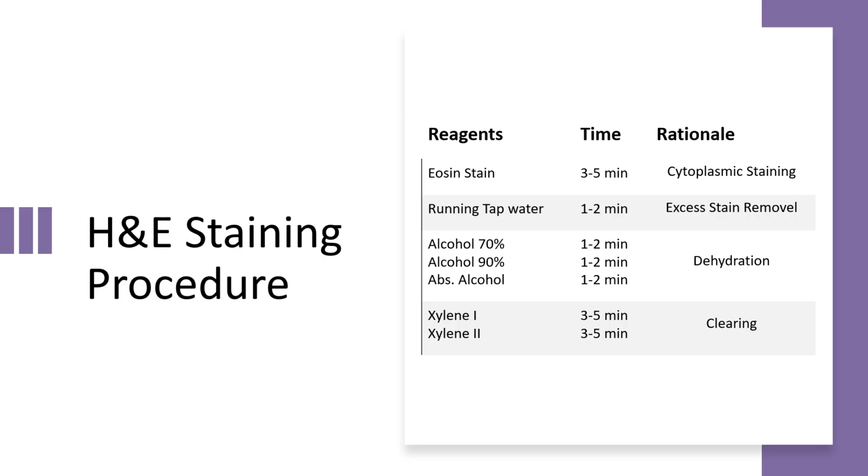After the dehydration, we put the slide in xylene 1 and xylene 2 for 3 to 5 minutes each, and this process is known as clearing, which also enhances the refractive index or visibility of the tissue under the microscope.